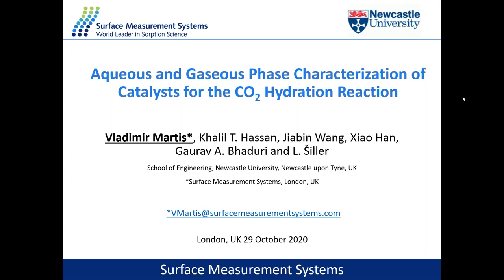Great. Okay, so as John mentioned, I'm going to talk about the use of gravimetric vapor absorption to characterize catalysts, in particular ones which are used for the CO2 hydration reaction.